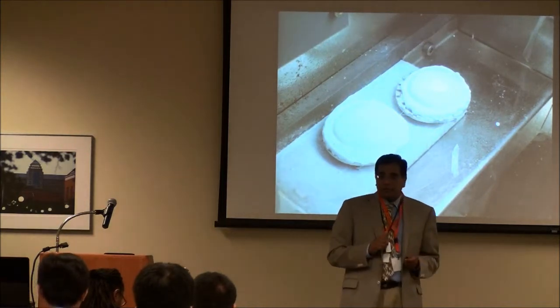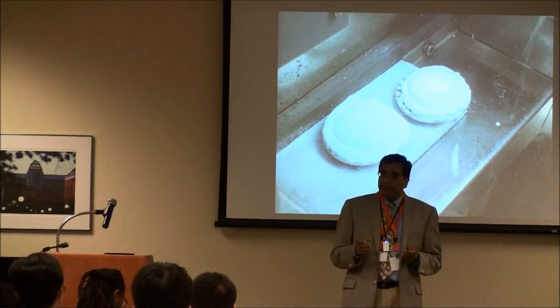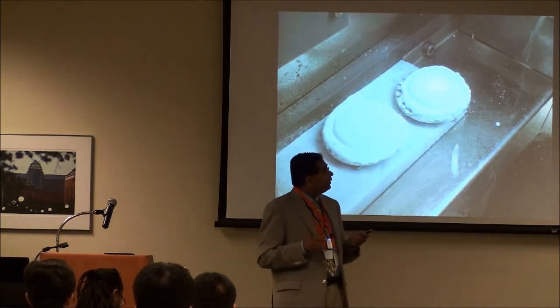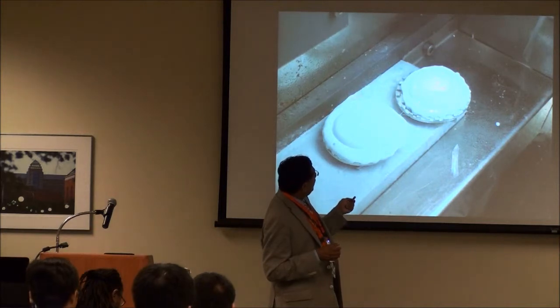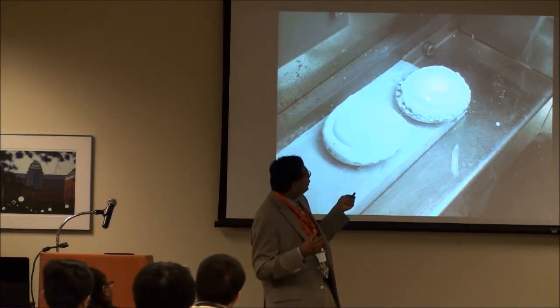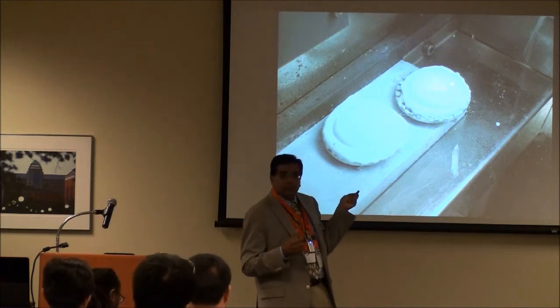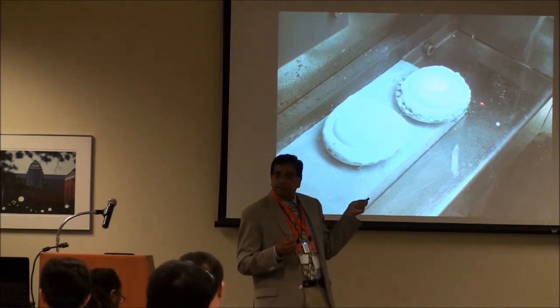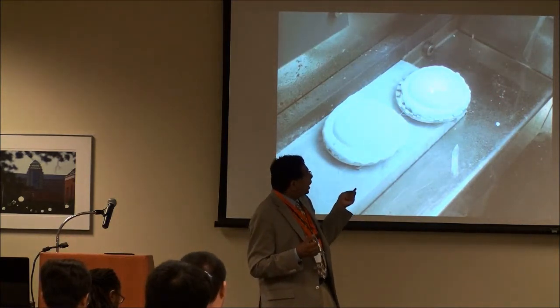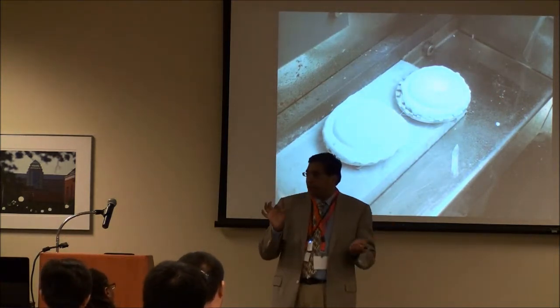So what we do is we get the specimen in the lab and we put a little bit of tissue in tissue tech, a material around the tissue, and then we freeze it to minus 30 degrees centigrade. After we freeze it, it becomes a frozen block at that point.